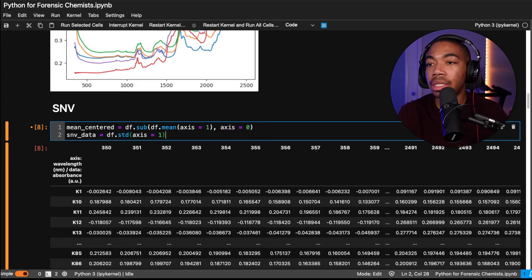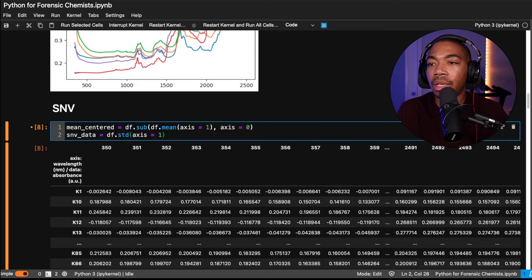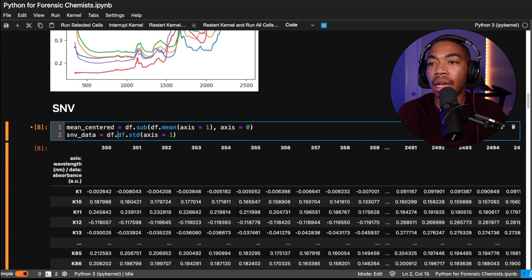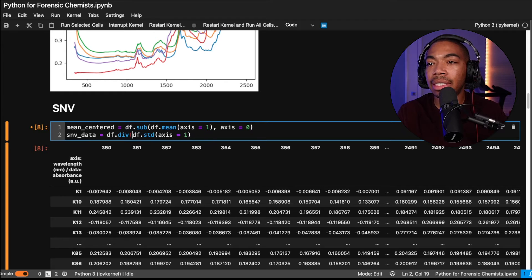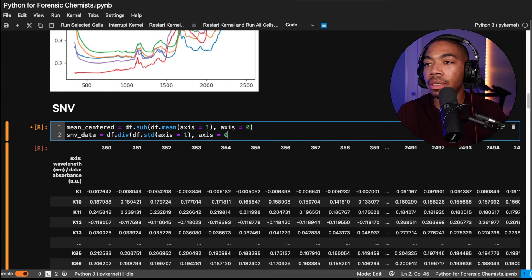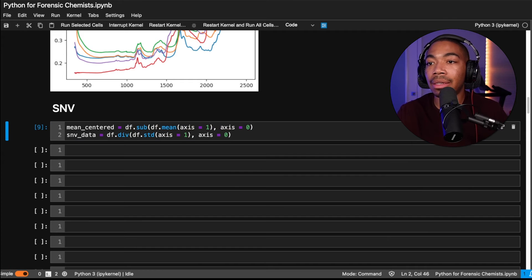And this will give us that. And instead of subtract, we will do divide. So df.div axis equals 0. And now we have our SNV data.